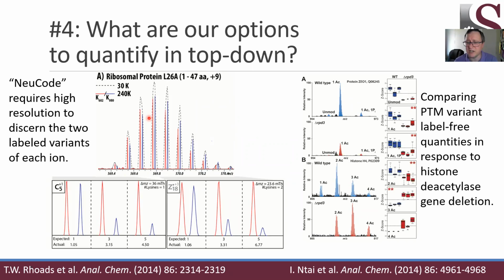It changes a fair bit, but it tends to be something that we do at the MS level rather than the MSMS level, but it is feasible. So that would be relative quantification, am I correct? That's correct. Yes. I would say though that almost all quantitation used in mass spectrometry is relative. You may be spiking in some amount of a known amount that you're comparing against, but you're still computing it as a ratio for your experimental. So relative quantitation is almost always the basis for doing this in mass spec. Good question.